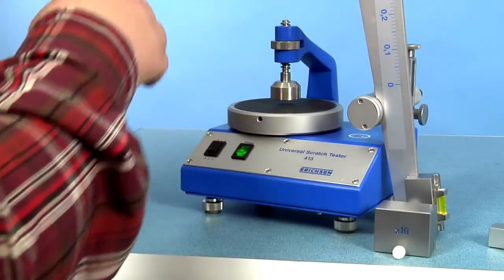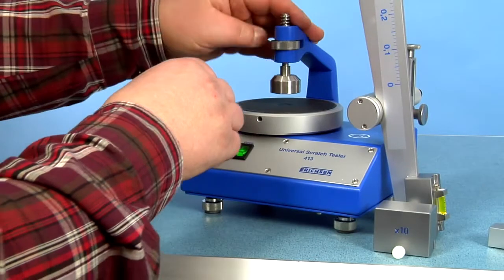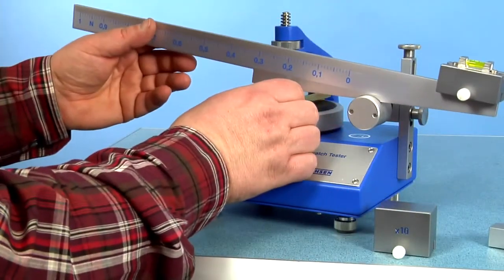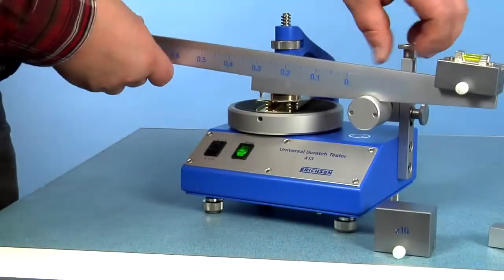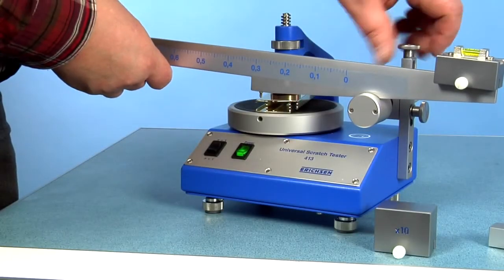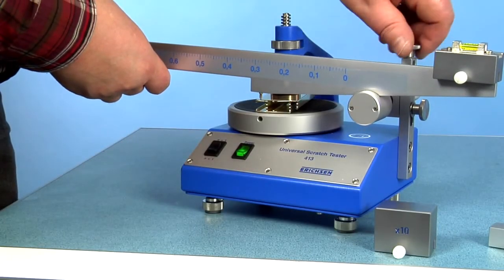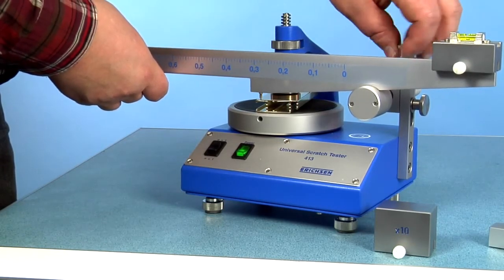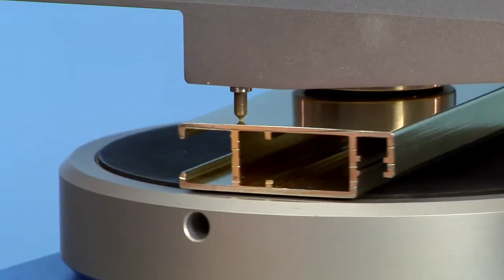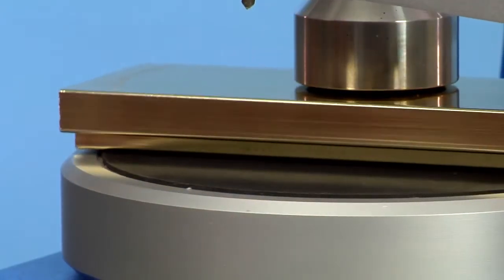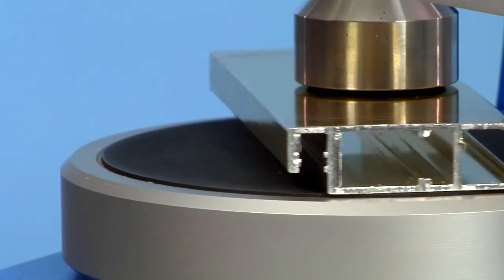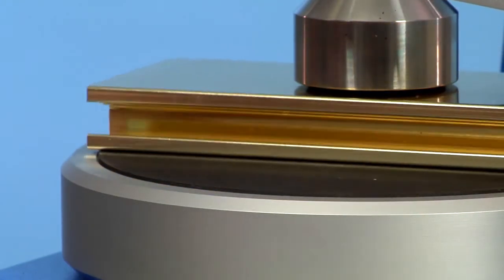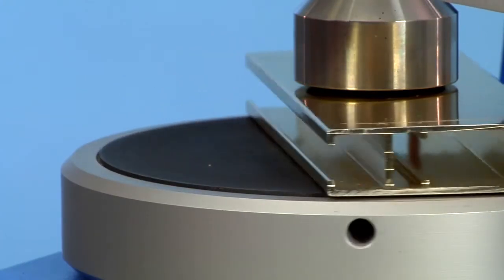For clampable samples, the performance is similar but even more convenient because there's no sample support plate necessary. The instrument is adjustable to various individual sample thicknesses.